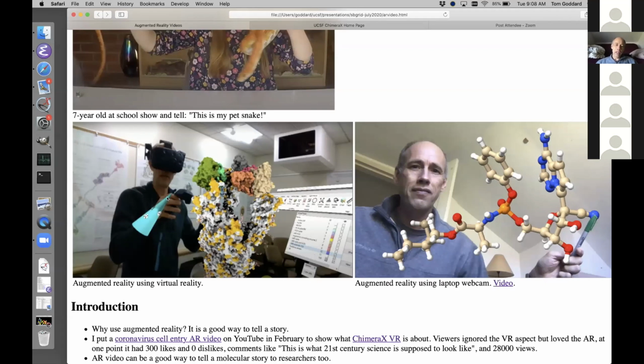So I think this way of telling a story about your molecular science can be very effective. That video was sort of targeted towards the public, and it was, of course, on this very current and hot topic of how coronaviruses work. But I think this could be used for communicating your research to other researchers, for instance, to make a video as supplementary material for a journal article. Okay, enough intro. Let me show you how this thing actually works.